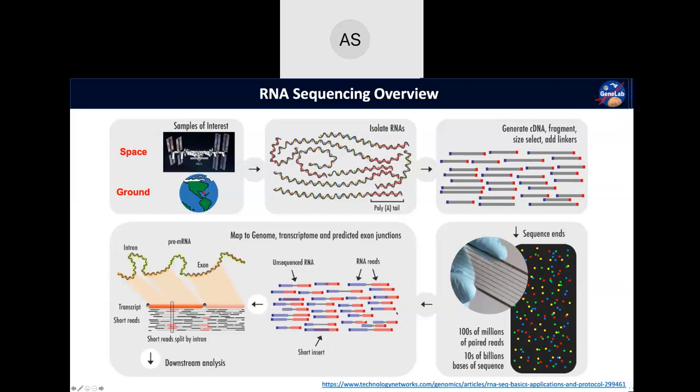Any questions about just the overview of an RNA sequencing experiment? No, okay.